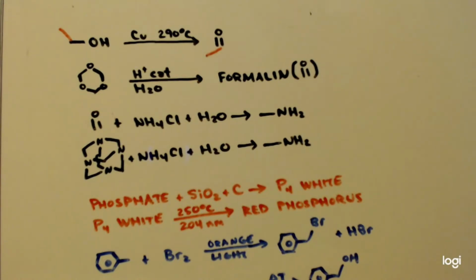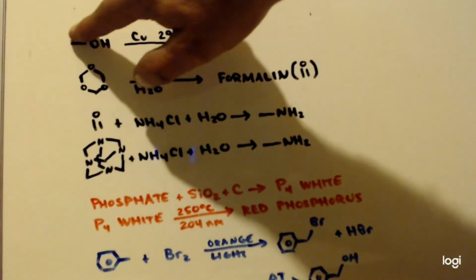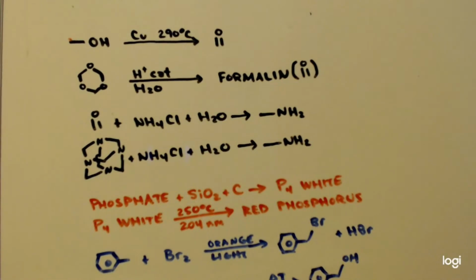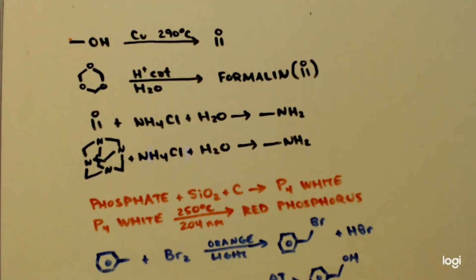So if I figure that out, I can make acetaldehyde from ethanol, or if you take the red part off, I can make formaldehyde from methanol. Now the way I think that I figured it out is to use this trioxane. I'm going to distill it, purify it, and throw it in some water with a little bit of protons like sulfuric acid. And that should make formalin, which is basically just formaldehyde in water. Then to prove that's what I made, I'm going to mix it up with some ammonium chloride and some water and make some methylamine and see if it really is formalin.